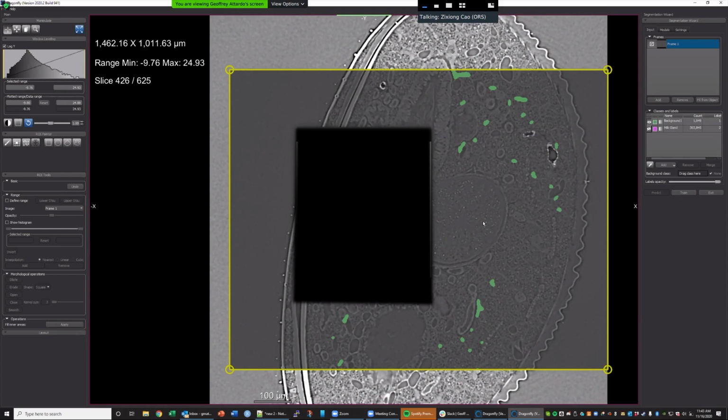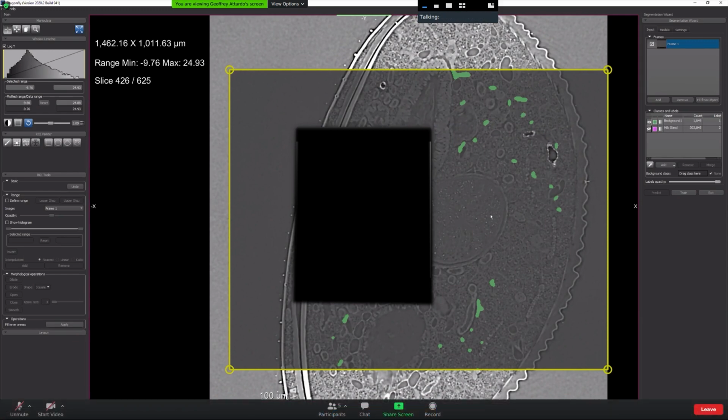But for you, since you already have the training data set, that's a manual segmentation, you could create like 3 or 5 frames. Normally 5 is good for most tasks. But more frames means more training time. So if you want to see it quickly, use fewer frames, like 3. If the trained model is good and you want to keep improving it, you can add more frames. Okay, gotcha.